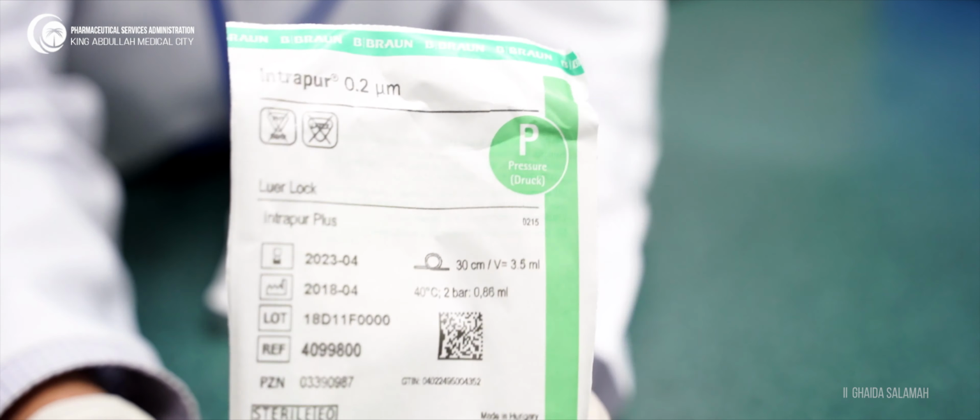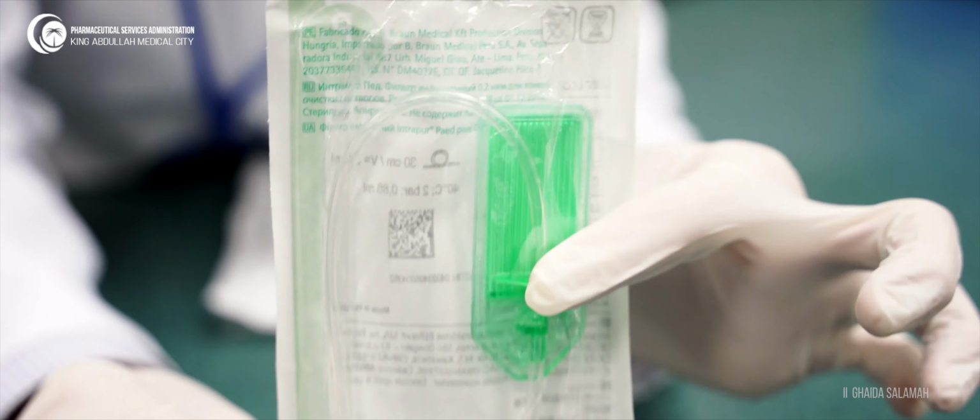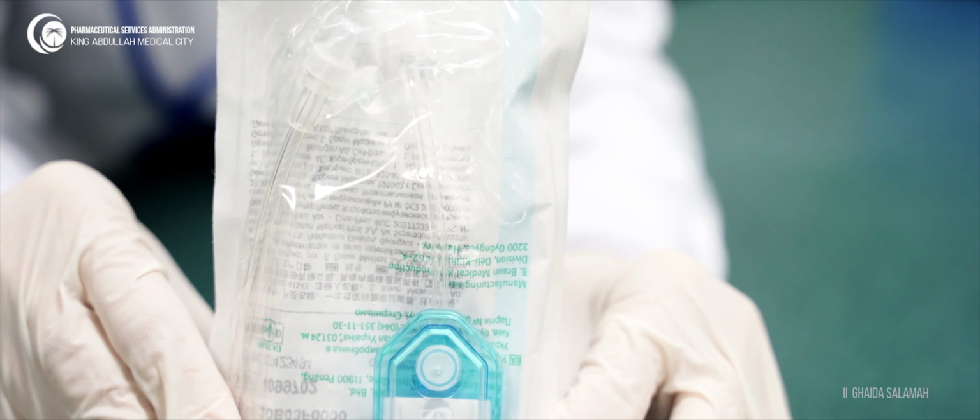Filters used for administration of TPN: we have a 0.2 micrometer filter for the TPN bag, and we have a 1.2 micrometer filter for lipid administration.